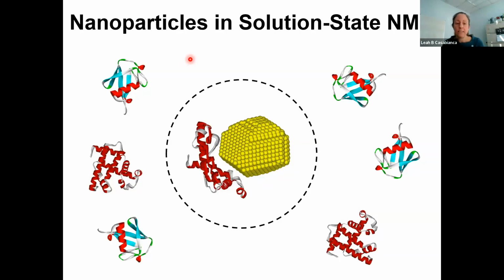For this reason, we need techniques that we can use to indirectly get information about the structure of something bound to a nanoparticle surface.